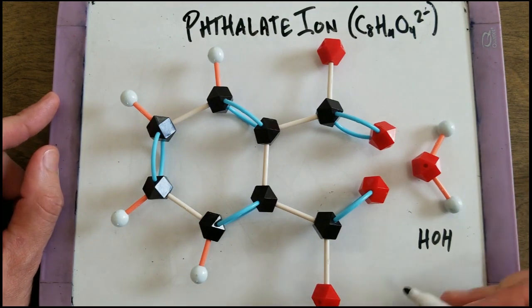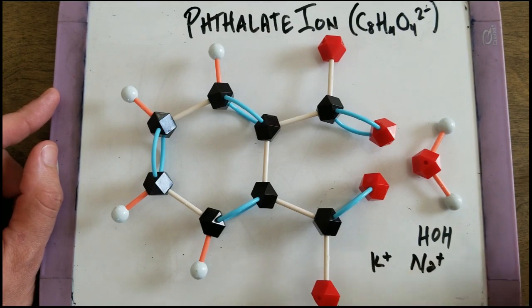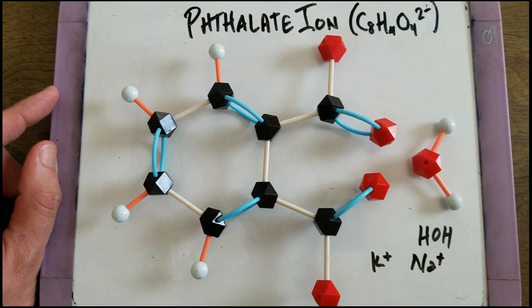So now this becomes a water molecule and the hydrogen phthalate ion is now just a phthalate ion. And there are still potassium ions and sodium ions floating around that I eliminated earlier because they aren't really participating in the reaction.